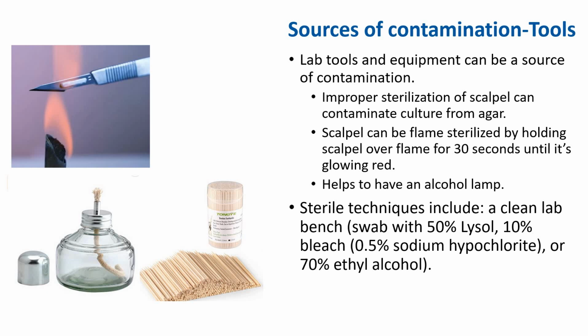Always sterilize your bench, clean down your bench using sterile technique, like a clean bench. So you swab that with Lysol or 10% bleach or 70% ethanol, which can inactivate a lot of the fungal spores and bacterial spores.